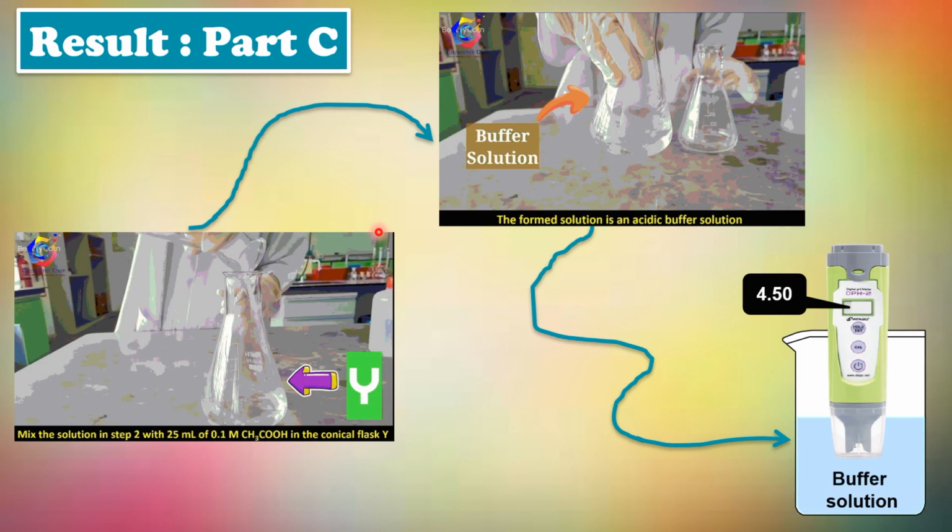Okay, for part C, this one is the preparation of buffer solution. After mixing conical flask X with Y, the buffer solution will form.